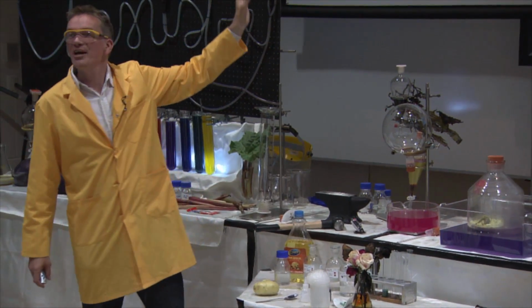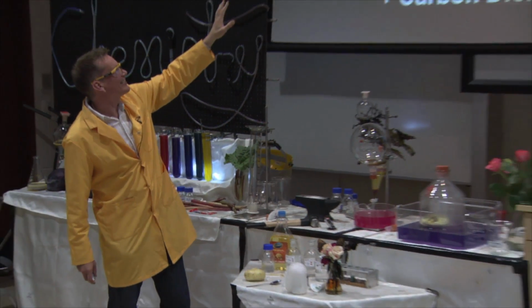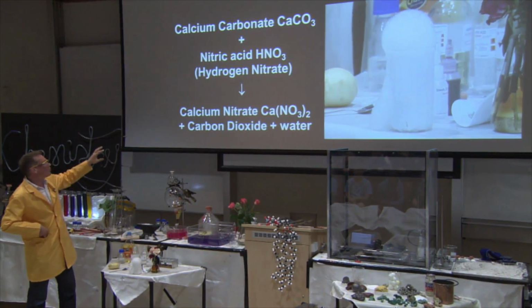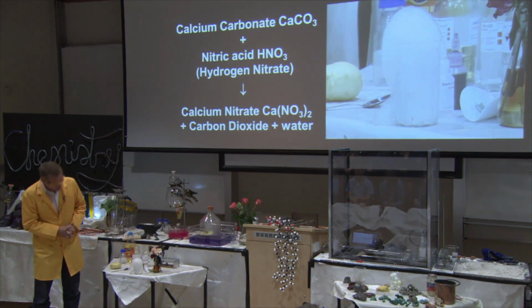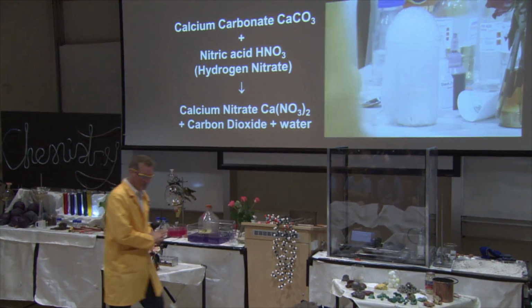So the chemical equation for this reaction taking place here is the calcium carbonate is reacting with this acid, in this case nitric acid, and we're forming calcium nitrate, but the bubbles of carbon dioxide we can see here oozing over the top. Never mind, we'll just leave that bubbling away, I think.